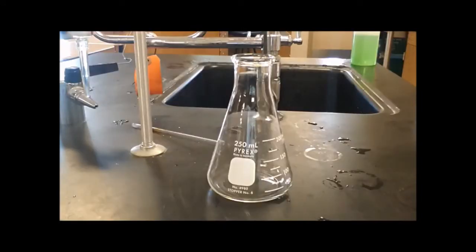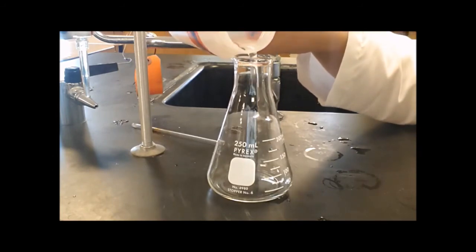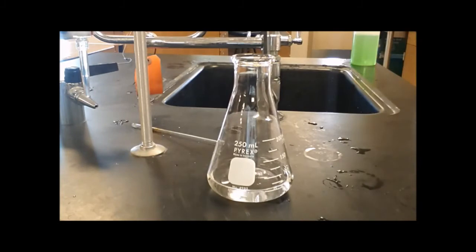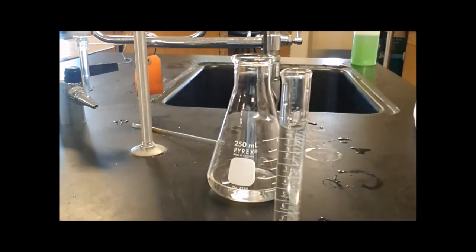The burette is prepared, and the starting volume of sodium hydroxide has been recorded. It is now time to concern ourselves with the other end of the titration, the flask. Into the flask, we're going to put the acid, but before we put the acid in the flask, it is always a good idea to add a little bit of water. As they say, do what you oughta, add acid to water. I'm not going to use very much, about 50 mils is fine. You can see, I have a pre-measured quantity of acid that I'm going to put in here, and I know exactly how much I'm using via a graduated cylinder.